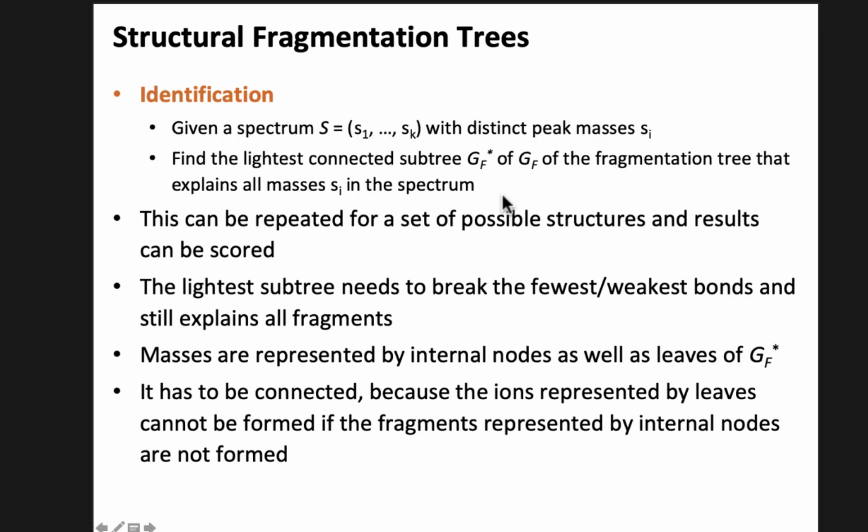What is a lightest connected subtree? Well, connected means that you can go from the root to all the leaves. It doesn't fall apart. The lightest is that you take only the parts that you really care about. So you remove all the rest that is not explained by the spectrum or is not needed to get to these fragments. And in this way, you can figure out how this fragmentation actually occurred. It's just a guess at how it occurs, but it's an educated guess.